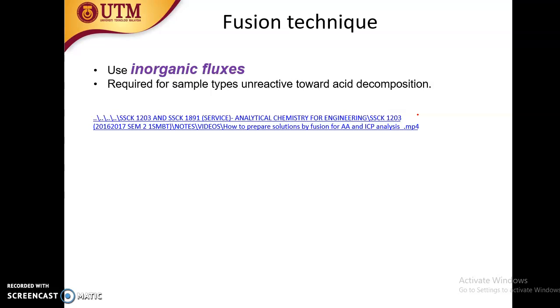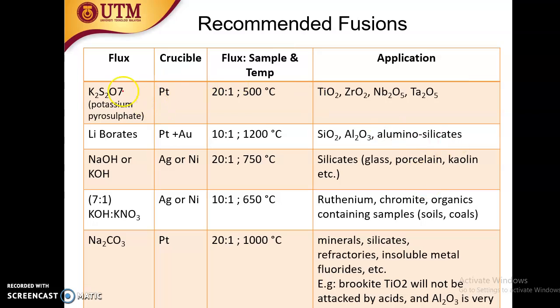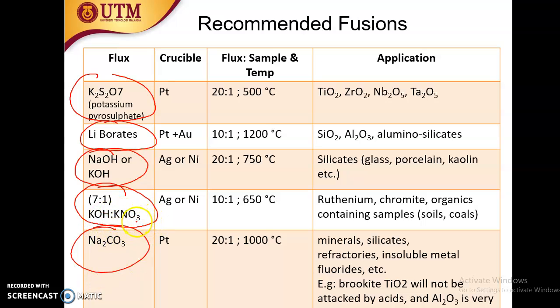And then we have the fusion technique. Fusion technique is a very old technique that uses inorganic flux. So what is flux? You can have a look inside books and ScienceDirect about flux. Basically, flux is a combination of salt. Salt can also use alkaline condition, and some of it use different kinds of alkaline condition, and can also use disodium carbonate. The temperature is given over here usually if you want to do certain application.